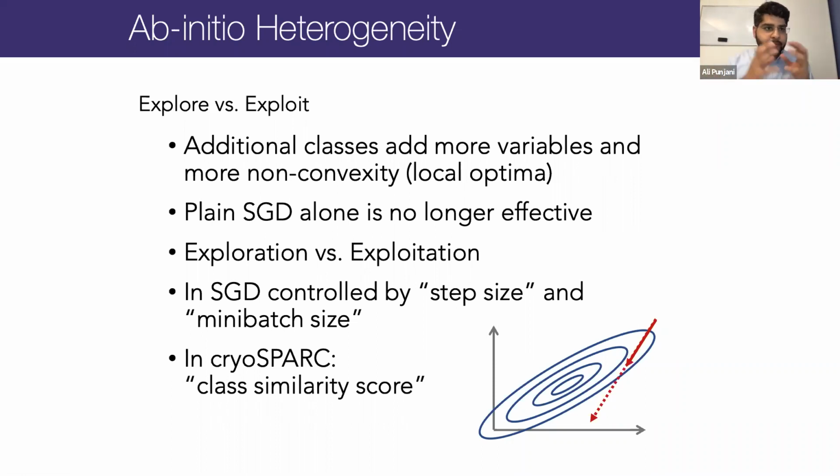You can think of the simplest case where you have 3 classes. One result may be to have 3 different conformations. An equally valid result would be to swap any 2 of them and create a different version of the result that is otherwise identical in terms of its significance, but mathematically different. And similarly, you could take any of the structures and rotate them, and that would create another valid version of the result, but a different version. Or if there are actually multiple clusters, you might find only 2 out of 5 or 3 out of 5. Or even if there are 5 clusters and you ask for 5 classes, the optimization may get stuck at a point where it has found 3 of those clusters and the other 2 particles are absorbed into the first three classes and can no longer be separated.